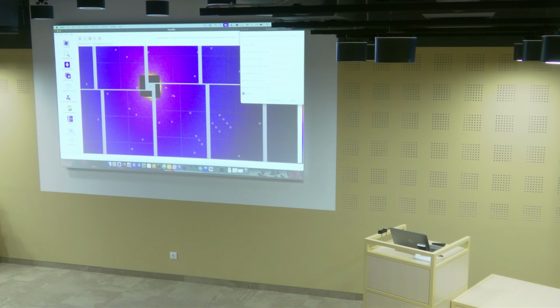So indeed, our peaks here are selected. Why are we not selecting a lot of peaks over here, which might have a value of at least 60? That's because we also have this signal to noise ratio. So if I would now decrease the signal to noise to a very low value, like 2, you get this. So this is definitely something that will not get you anywhere. Most of the time, a value of signal to noise between 4 and 5 might be okay.